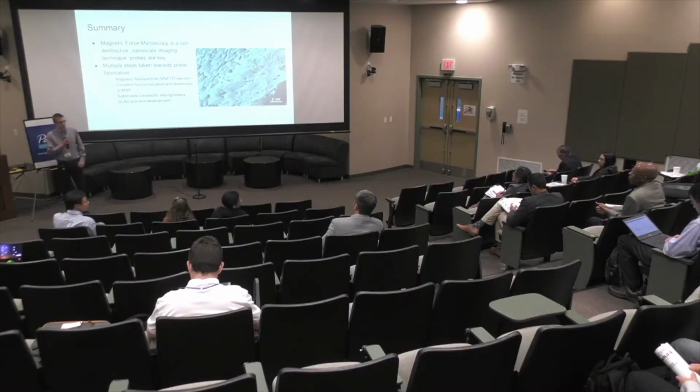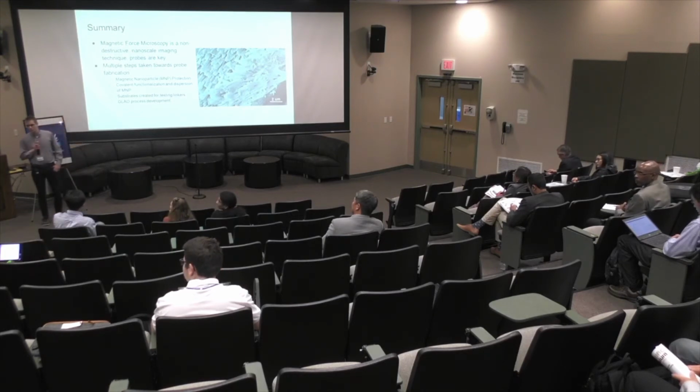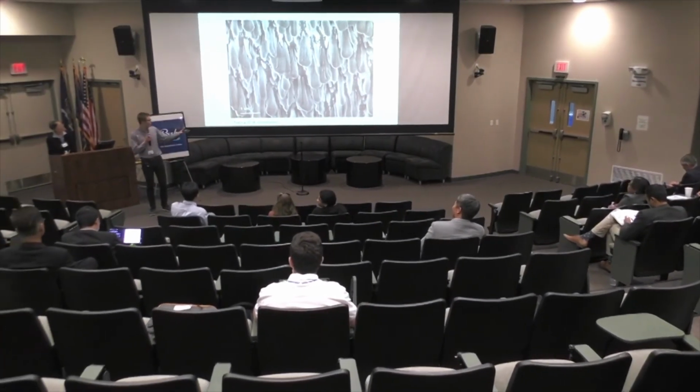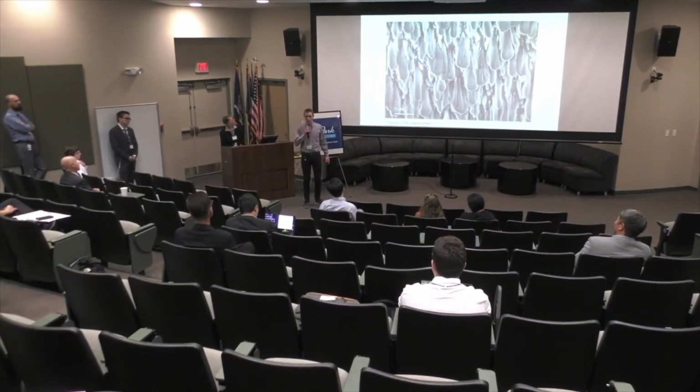Can they be used to image within a liquid-solid interface, rather than just ambient? I'm not sure about that. In your second method of growing it, what kind of radius were you able to achieve, sharpest? So the dummy particles we used as the tips here were the ones I grew, so they were between 50 and 100 nanometer graphitic iron particles. But in theory, this shadowing should occur regardless of diameter, which is an experiment that we're currently running.